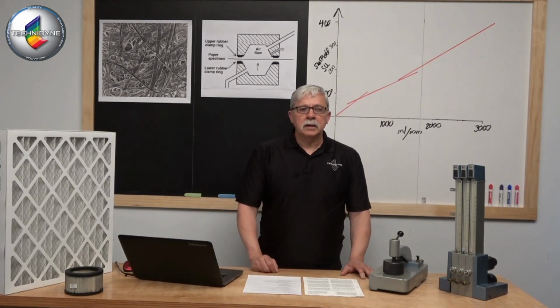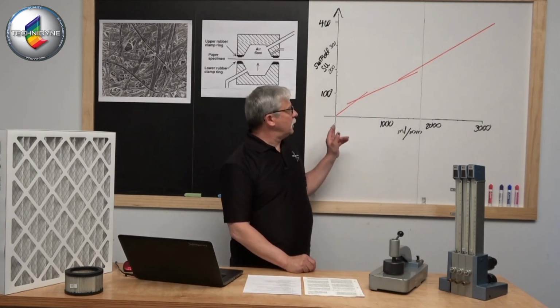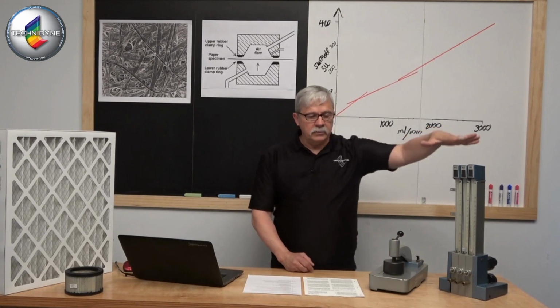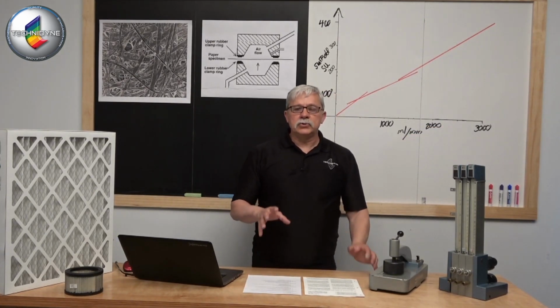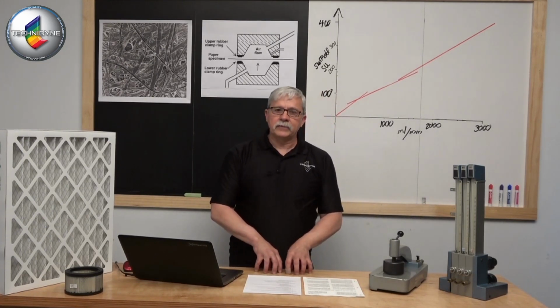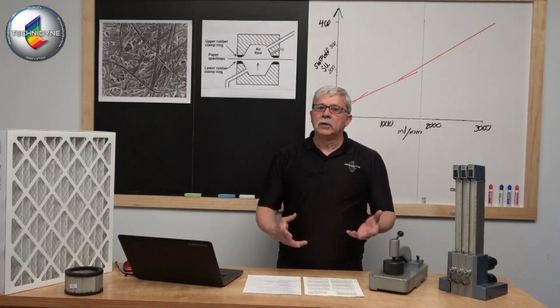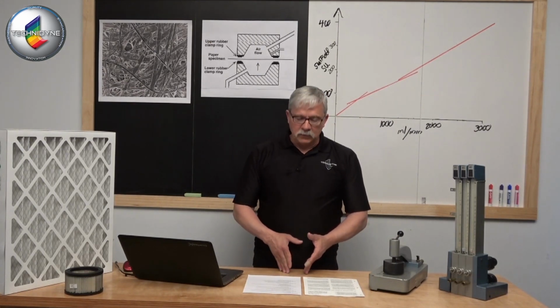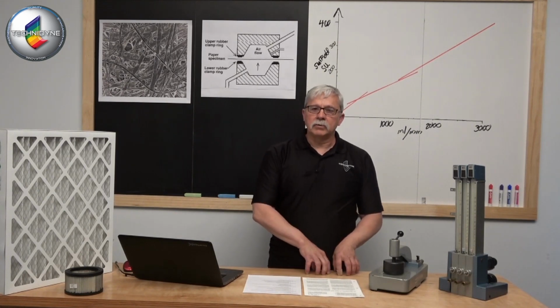Now, one thing to keep in mind, even though we can develop a relationship between milliliters per minute and this scale, you still have to keep in mind that if you switch from one orifice diameter to another, even though you're reading on this particular scale, 170 Sheffield units doesn't necessarily mean the same thing with a 1.5 inch orifice diameter that it does with a 3/4 inch diameter.